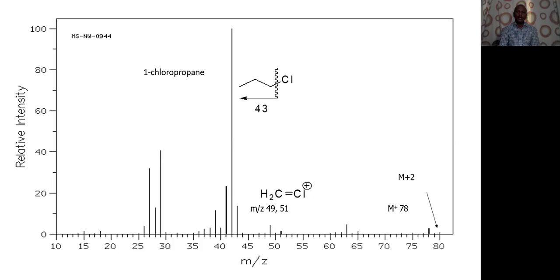And the ratio of the intensity, you can also see here, is 1:3. So chlorine 35 is more intense, that is 3, and chlorine 37 is less intense, that is 1. That means if we take 4 molecules, of those 4 molecules, 3 molecules will be chlorine 35 and 1 molecule will be chlorine 37. So a 3:1 ratio, that means 75%, if we consider 100%.